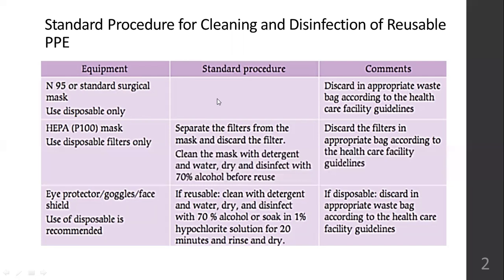HEPA mask, P100 mask. Only the filters are disposable. The entire mask you don't have to dispose. You can remove the filters and then discard the filter. But the entire body of the mask, you can just take spirit, 70% alcohol, and disinfect it, or use detergent and water, clean it thoroughly, rinse it thoroughly in cold water and dry it. Then put a new filter in and use it again. So only filters you have to discard. The mask can be reused using spirit.